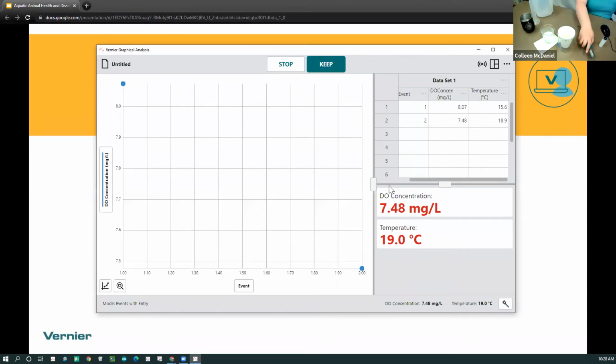And event 2. All right, then I repeat the process again. And we're going to keep doing this until our water reaches basically the equivalent of room temperature. So I start my timer again and I keep shaking. Now, this is going to be the last one I do for the cold water, just for sake of time, because I don't want everybody to just stare as I shake water. It's not a very exciting moment.